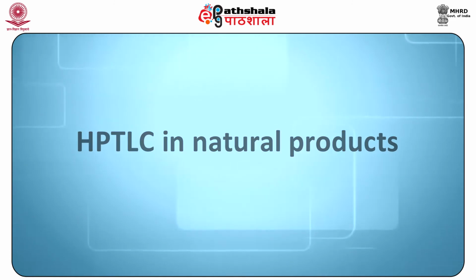HPTLC in natural products. The HPTLC technique is rapid, comparatively simple, robust and extremely versatile. HPTLC not only confirms but also establishes identity. It is also an ideal screening tool for adulterations and is highly suitable for evaluation and monitoring of cultivation, harvesting and extraction processes, and for testing the stability of products of natural origin. HPTLC is used in fingerprinting analysis of drugs of natural origin.